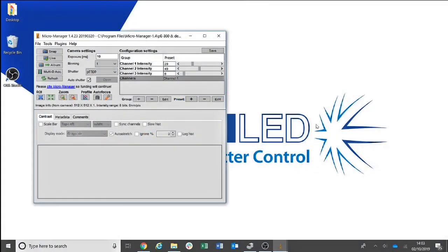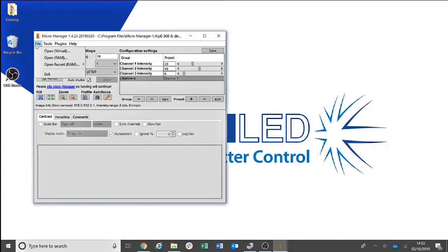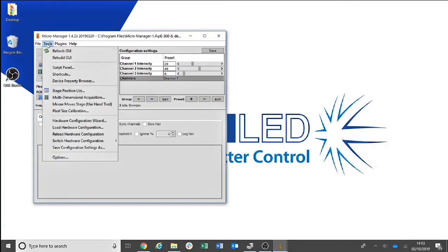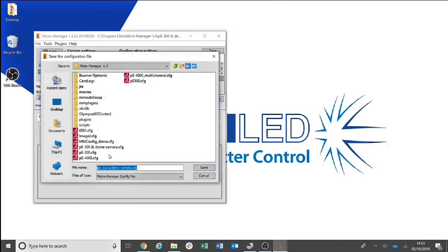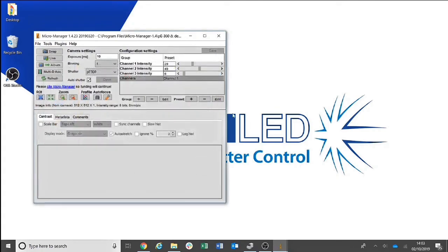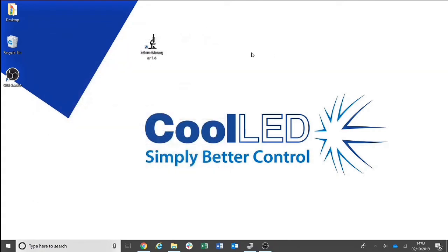Once you are happy with your configuration settings, be sure to save the configuration file. The next time you open Micromanager, you will then be able to load this configuration file and your settings will reappear.